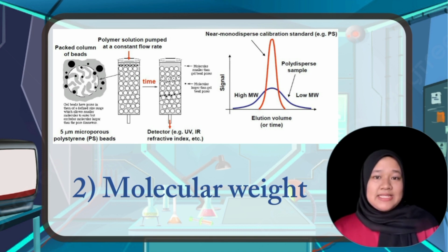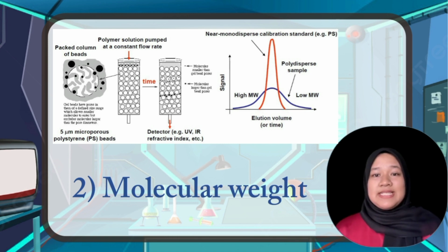Essentially, SEC is a useful tool for understanding the size distributions of polymers, which is important in various applications.